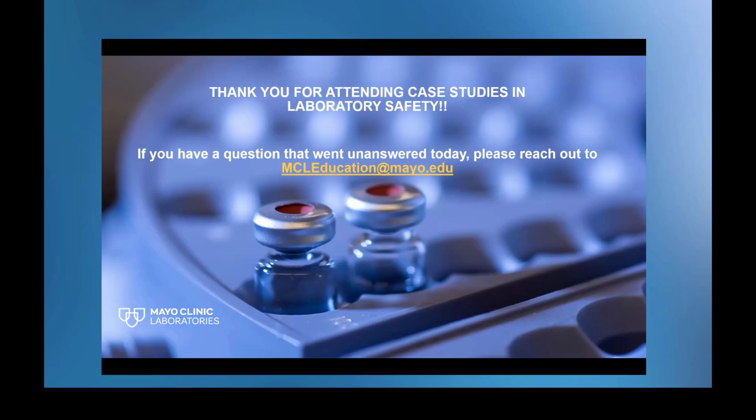How do you handle cell phone use in the lab concerning safety? Personally, from a safety standpoint, I hate cell phones in the laboratory. There was recently an article in Laboratory Manager about the risks of having cell phones in the lab, the least of which was contamination, the worst of which is it gets on fire and you have a lithium ion battery, which you can't exactly extinguish.